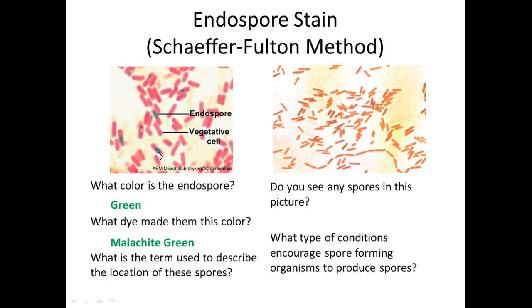As you can see, the cell in this picture has the endospore within it, and that's why it's called an endospore. It forms within the cell. Then eventually the cell would deteriorate. As you saw in my slide, there were a lot of what we call free spores, right? You had to kind of look around to see the red cells and potentially see some inside. So on the test, under the microscope, I'm not going to ask you arrangement like you see here. As you can tell, it's really difficult to determine.